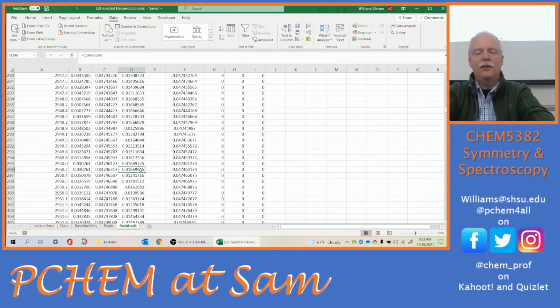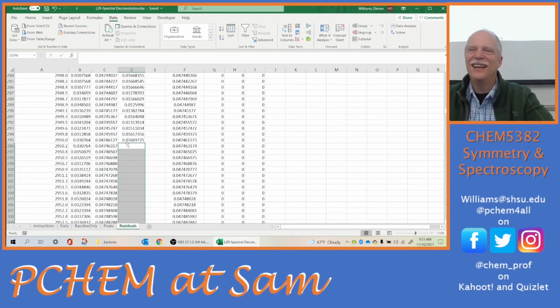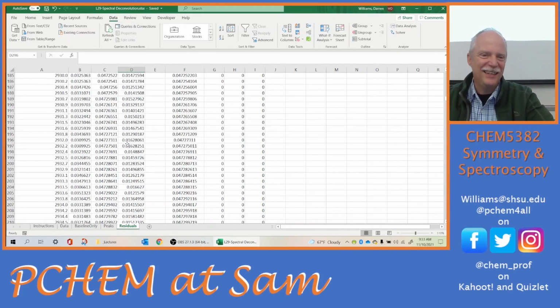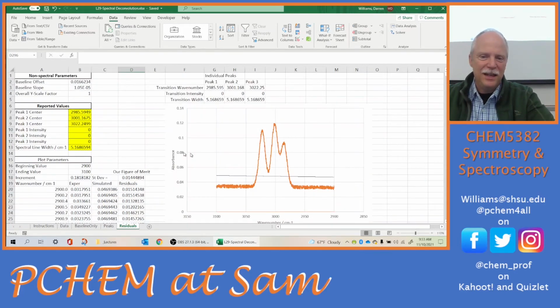And I'm going to take all the residuals from there down and just delete them. And so I'm only evaluating the overlap on the baseline from 2900 to 2950. But if I can match this, it's probably going to be decent. Does it make sense? I'm picking a baseline region to match for my baseline optimization.